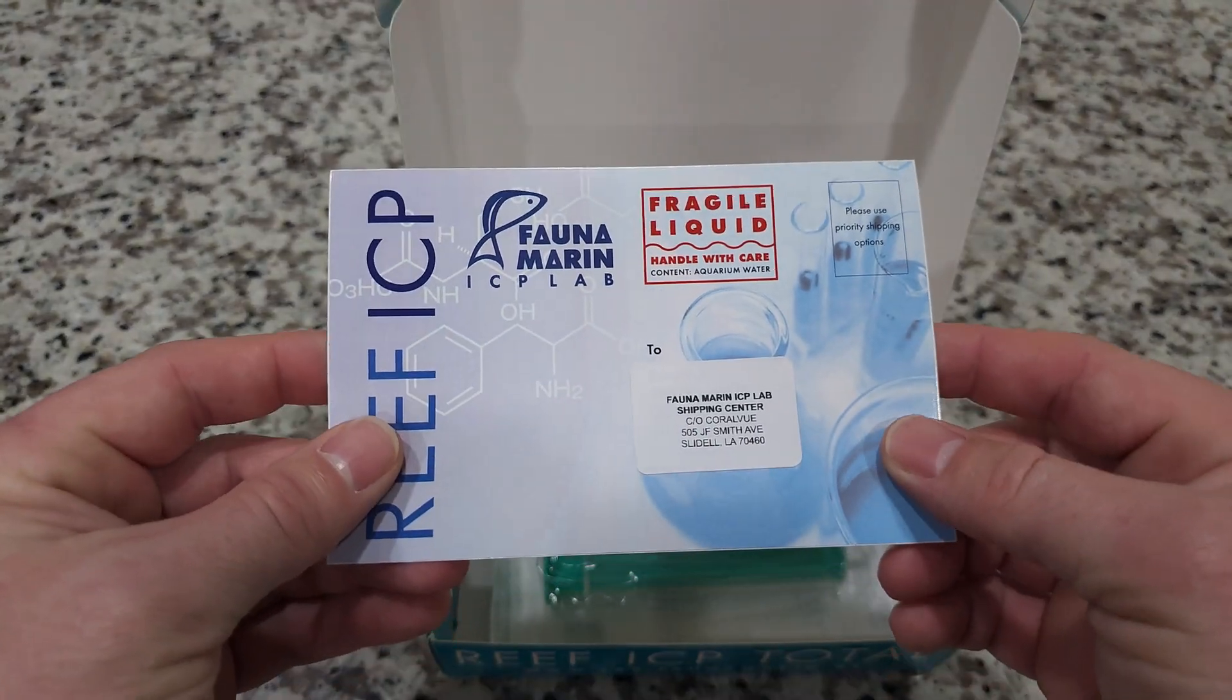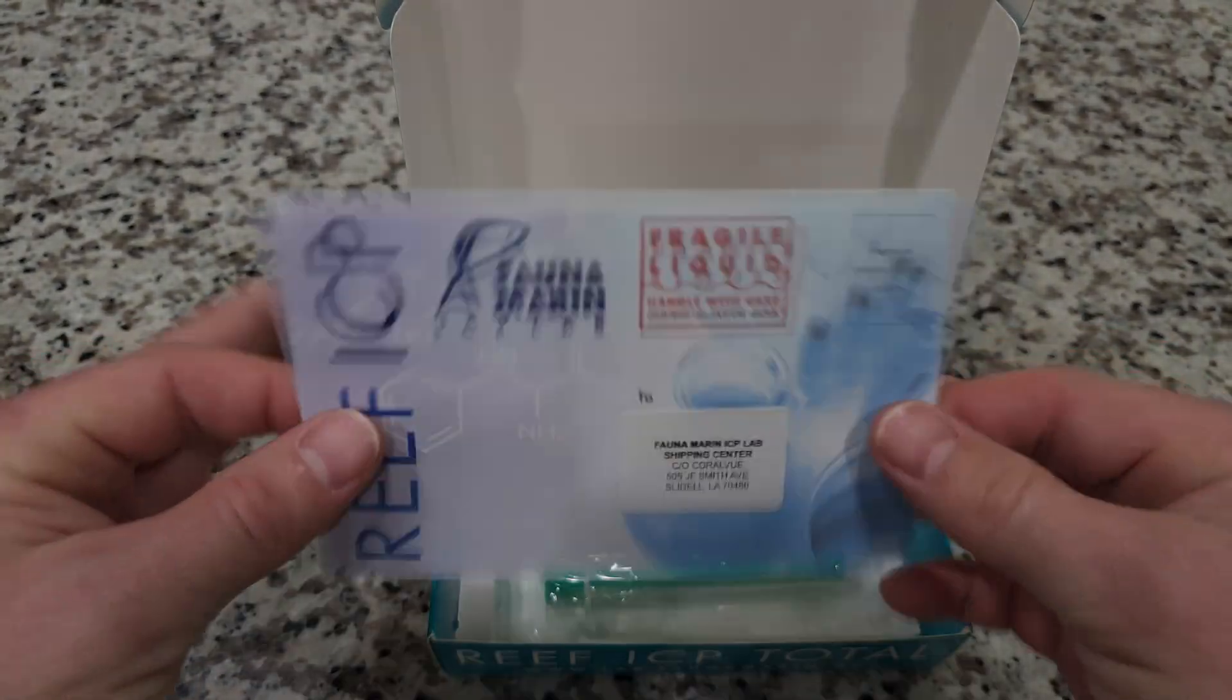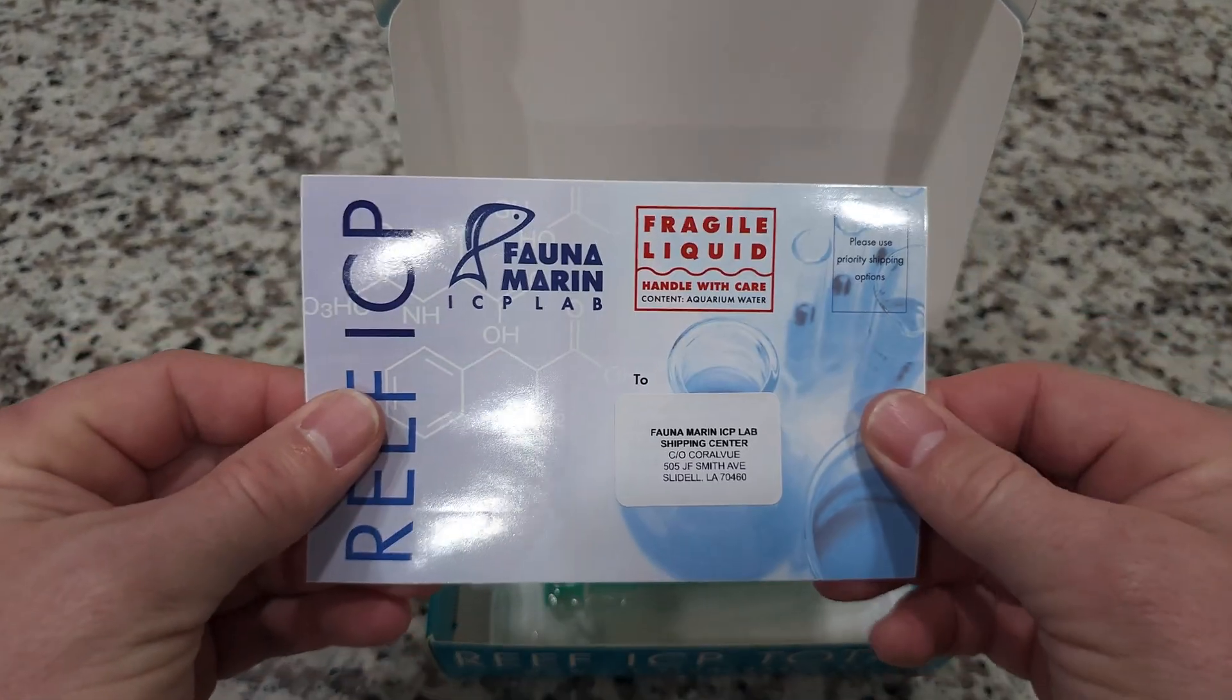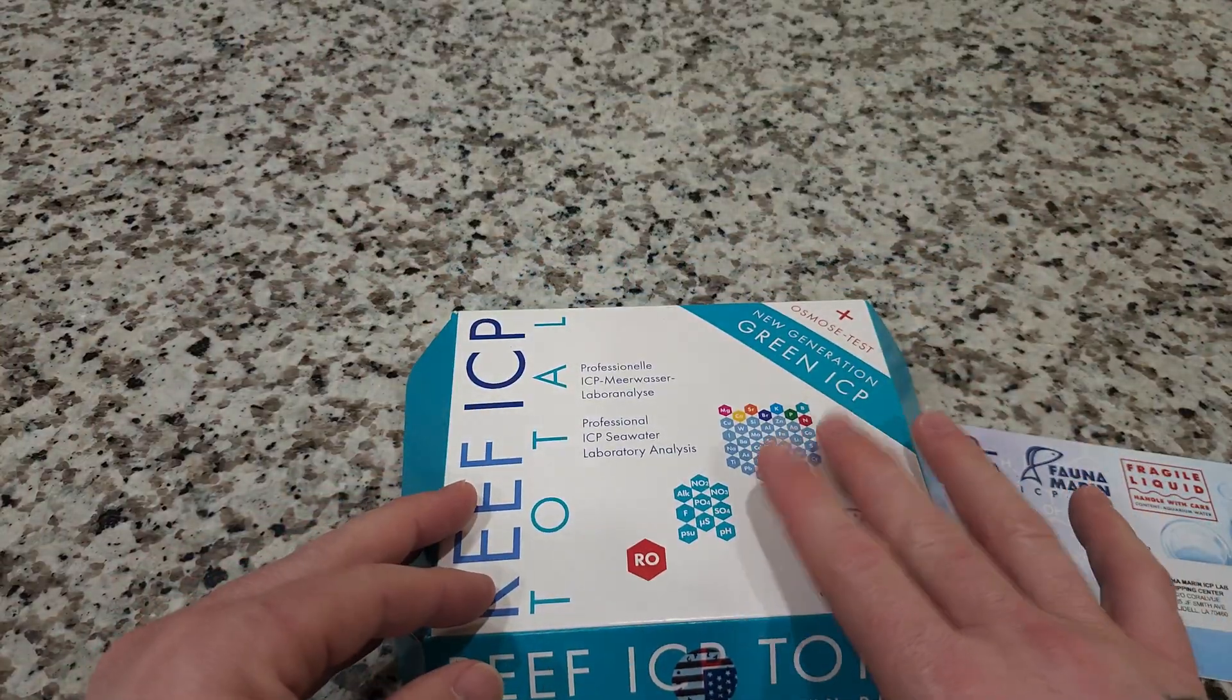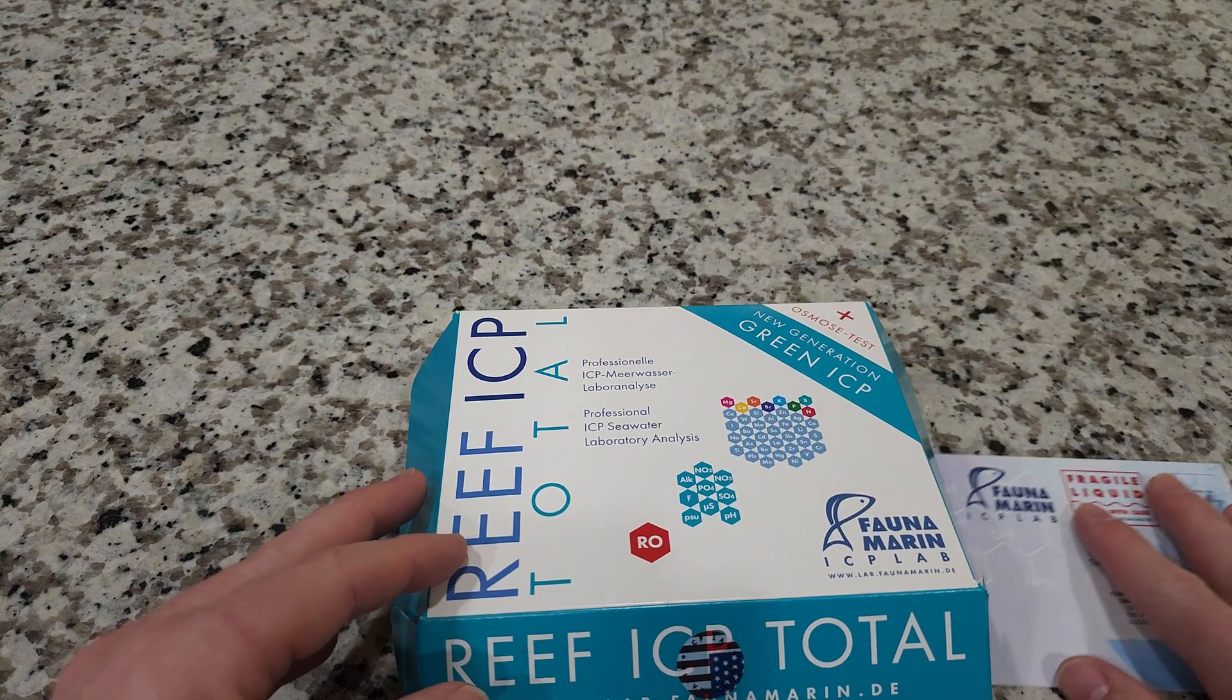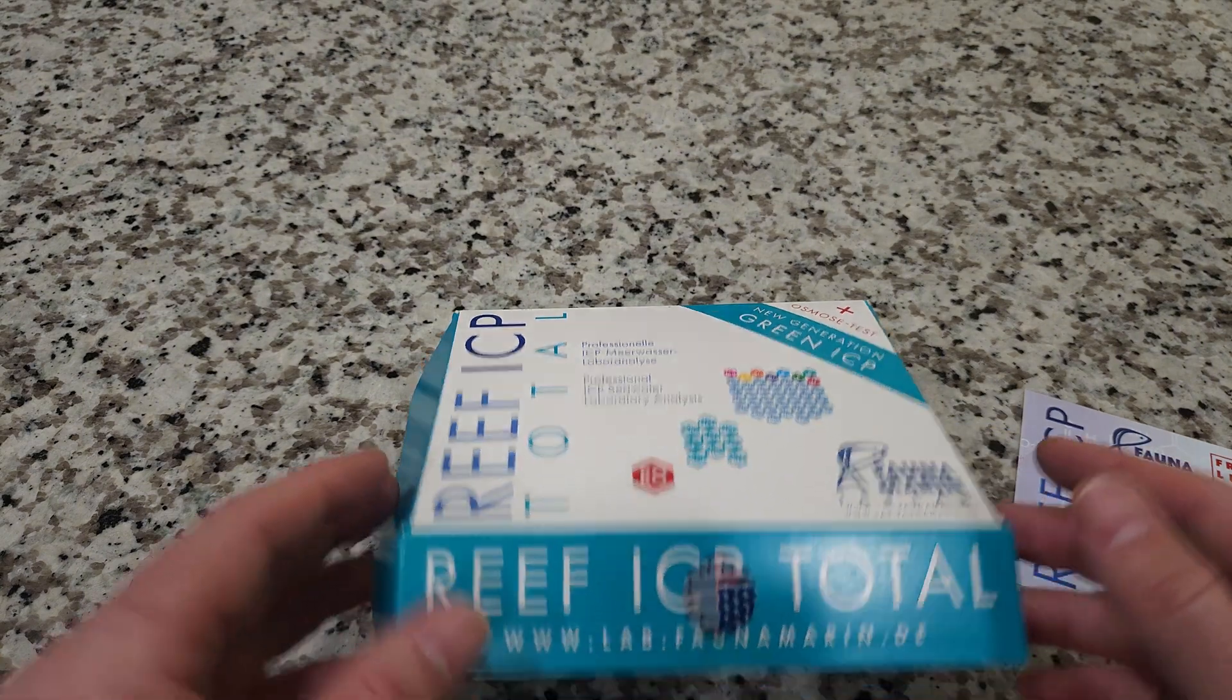Moving right along, this is the shipping label. You're going to affix this to the box once you get finished and stick this in the mailbox.